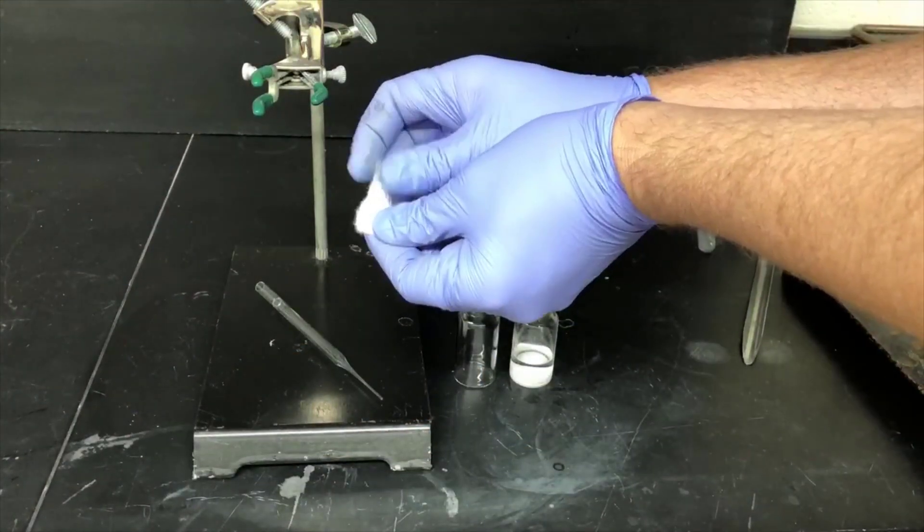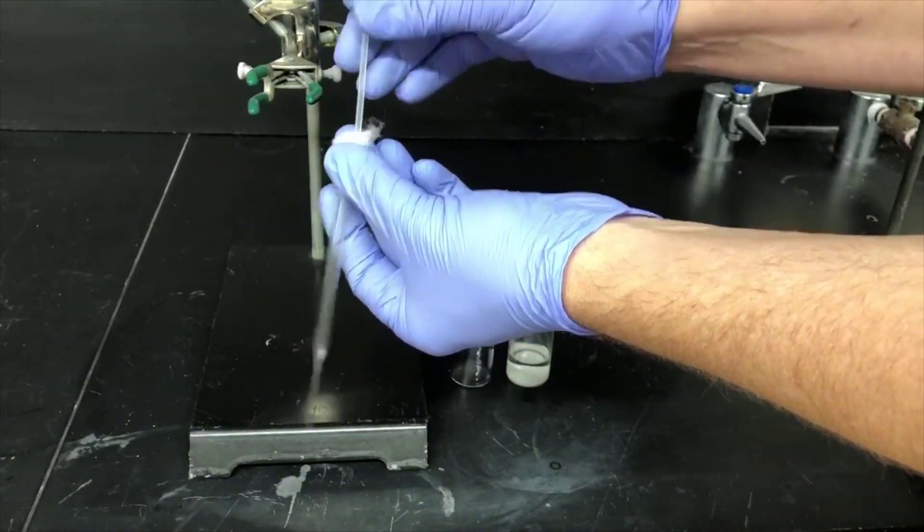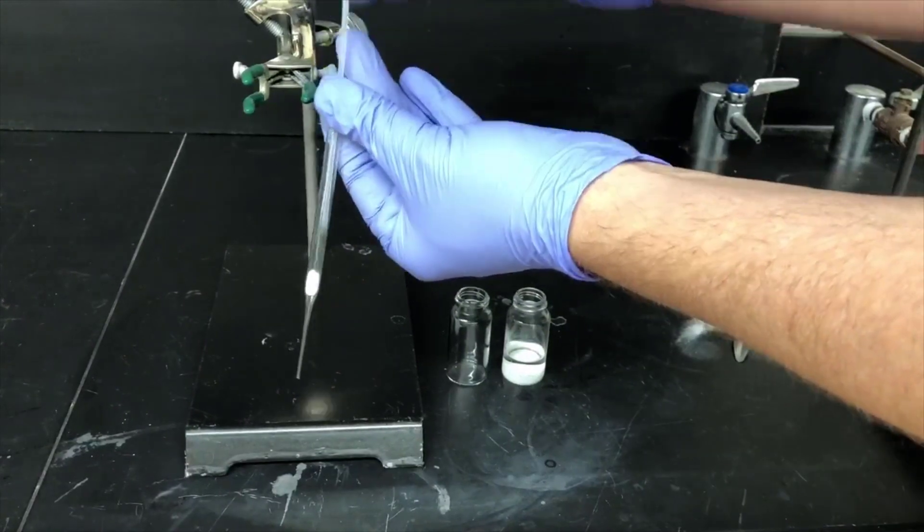Now we're going to filter our solution into that vial we just weighed. Here I'm getting a little tuft of cotton, and I'm going to put it into a disposable pipette, packing it lightly into the tip.